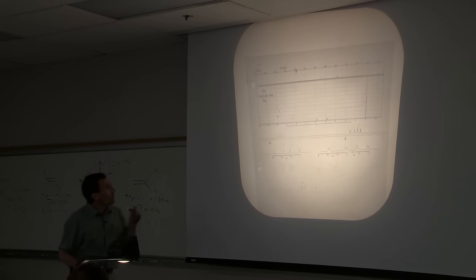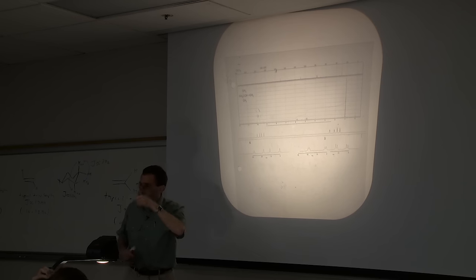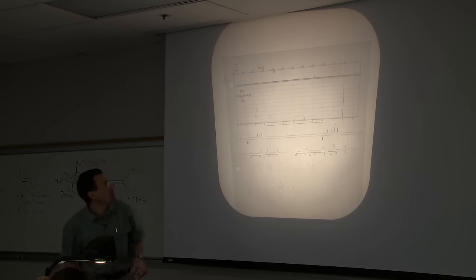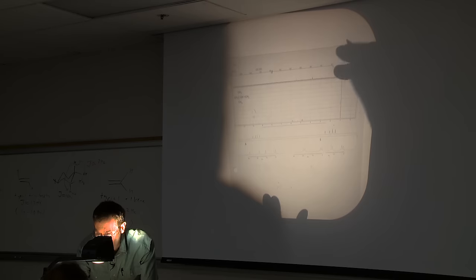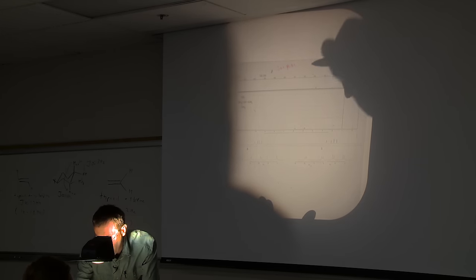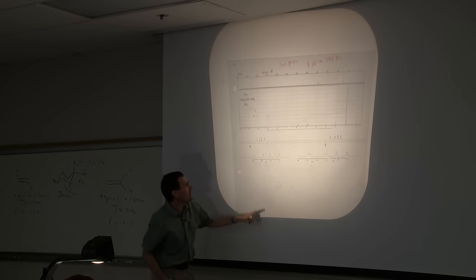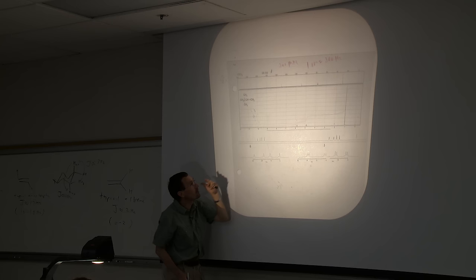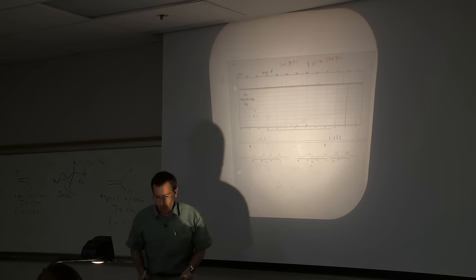Okay. So one of the things that I like is the spectrum actually can be manipulated because it's PostScript, it's line art. So I can actually go ahead and stretch and shrink the scale. Now, they don't give a peak printout, but this is done at 300 megahertz. At 300 megahertz, 1 ppm is equal to 300 hertz. And so by just taking this scale here and shrinking it and expanding everything, I was able to make a ruler. So here we see our spectrum of tert-butyl ethylene.